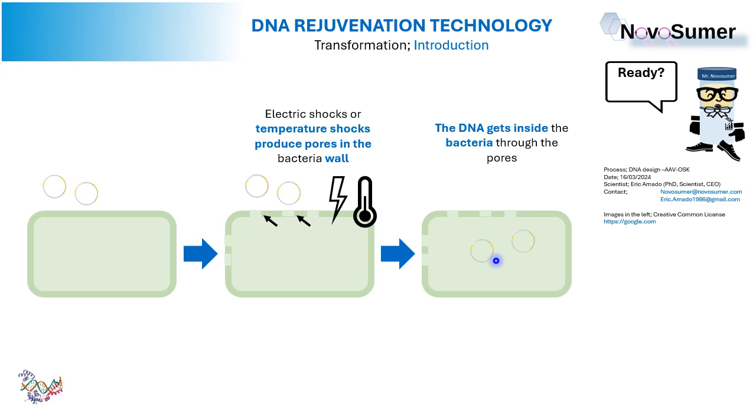The pores will disappear and the DNA will settle inside. That was easy, right? Let's go for the next slide. We will see the actual steps that are performed in the laboratory, the steps to insert the DNA inside the bacteria cells.